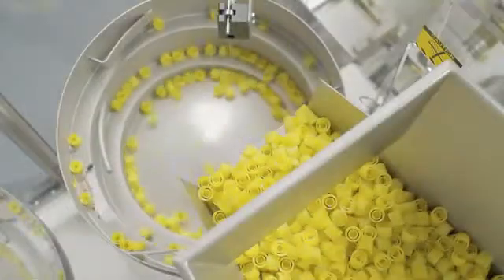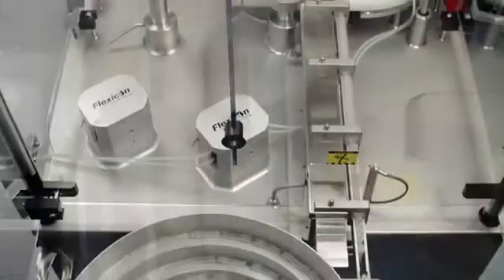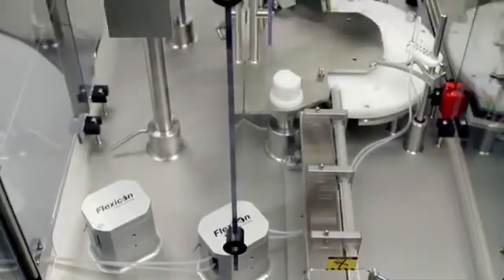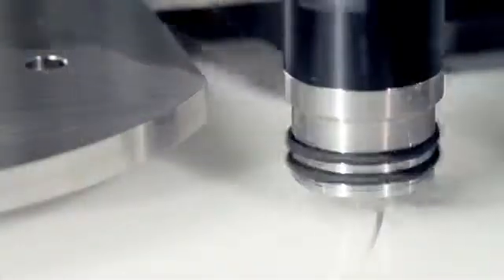Production costs are minimized with a single operator able to fully manage up to 2,200 units per hour. A production run can be set up in under 20 minutes making the achievable total capacity per working day unique for this size of filling and capping solution. The FMB210 is perfect for small to medium sized batch runs.